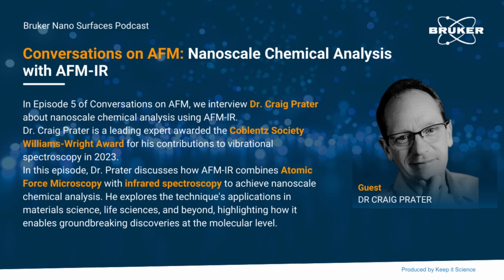Yeah, and before moving into that question, I wanted to mention the fact that AFM-IR and OPTIR are really complementary techniques, and in many cases, many labs are using both techniques. They're using AFM-IR when they need very high spatial resolution. They're using OPTIR when they need to image larger areas of the sample, and so it's not uncommon to see publications where both techniques are used. And in terms of applications, there's a lot of overlap in the applications, but the big applications for AFM-IR, polymers is absolutely a really big area.